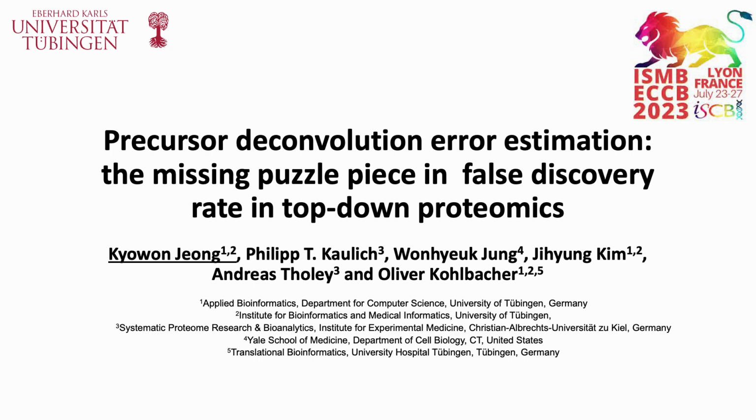Today I'm going to present our recent work on FDR control in proteoform identification via top-down proteomics. As shown in the title, I will present the effect of errors in precursor mass determination upon the FDR control.